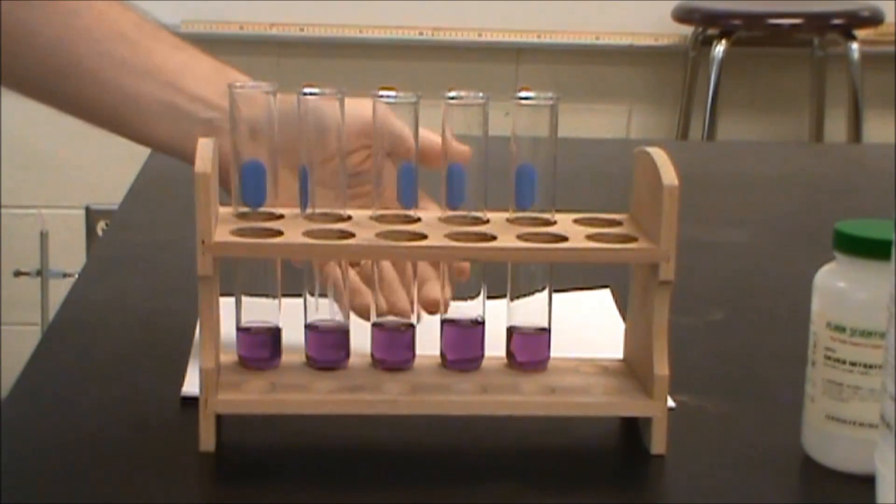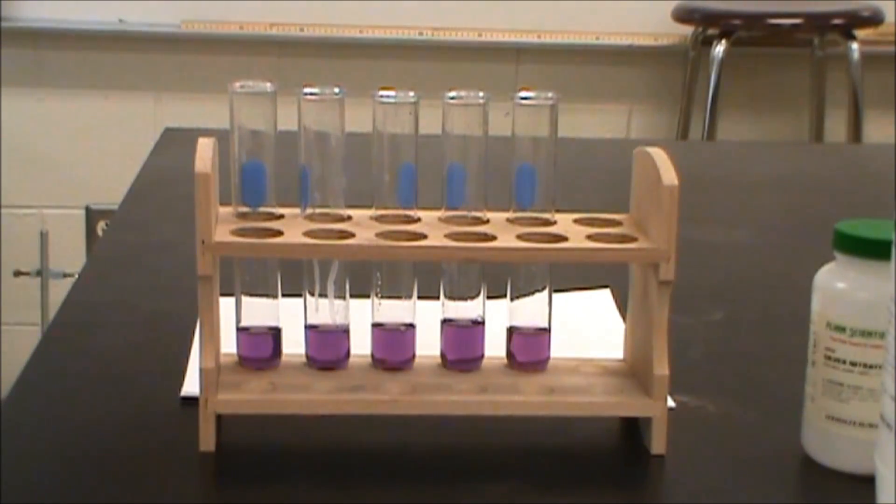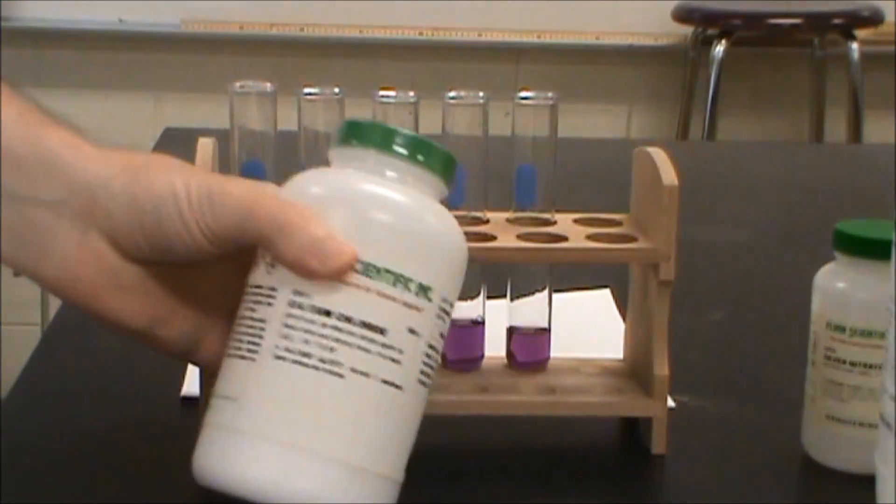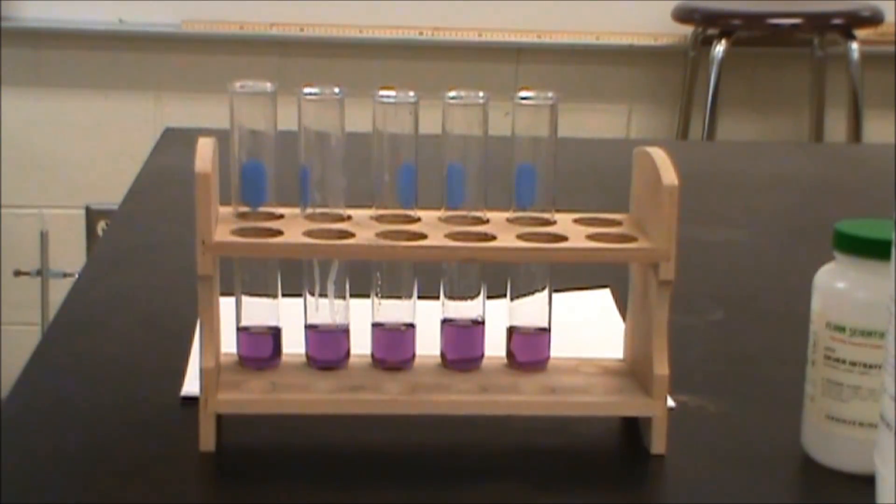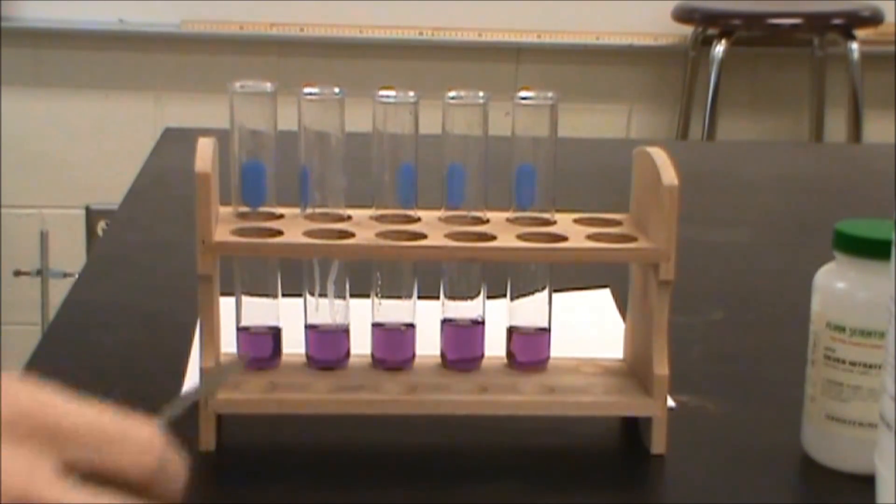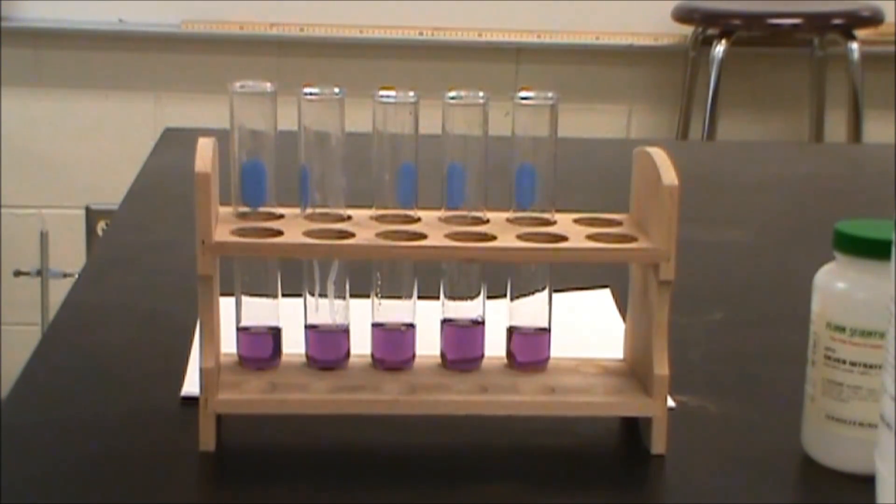So here we have five solutions set up. I'm going to do the first four. We're going to add calcium chloride, water, silver nitrate, and acetone. And then I have a fifth here so we can compare the color after we're done.